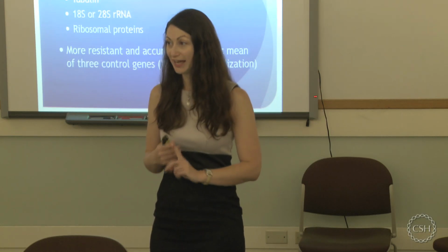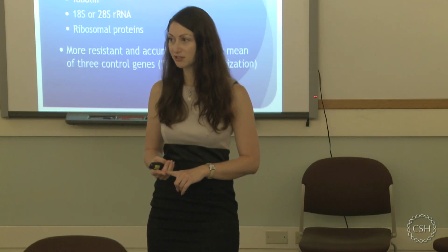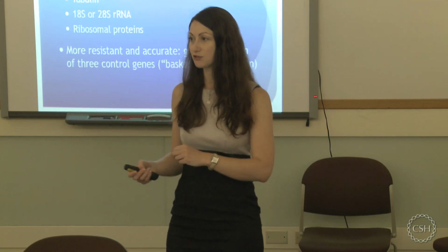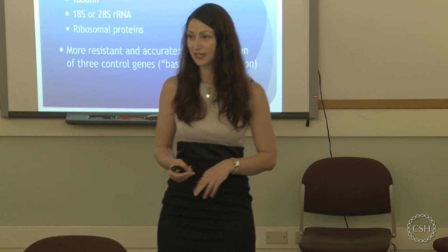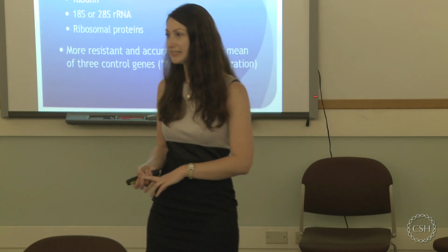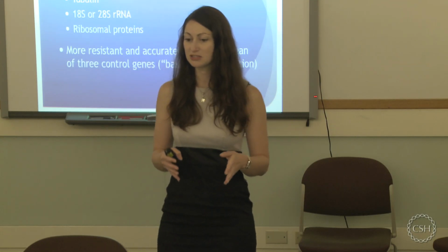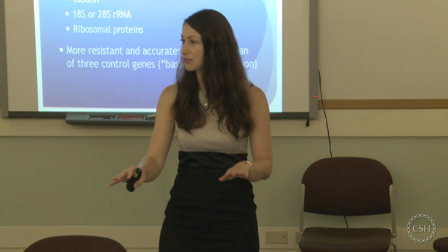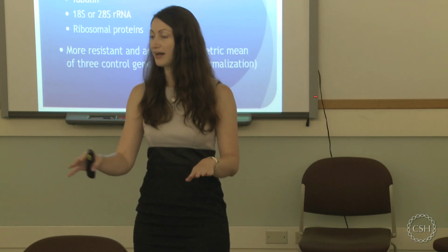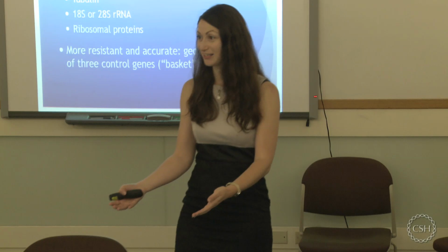So what you absolutely have to do is use a consistent amount of RNA as starting material. So you always have to check what's my RNA concentration and use the same amount of RNA for all of your reactions. You also have to be careful about the linear range of your cDNA synthesis reaction. They usually tell you that in the manual, this cDNA synthesis reaction is stable between 10 nanograms and 1,000 nanograms, let's say, and then you shouldn't use 5,000 nanograms because you're not going to have a linear amplification anymore.